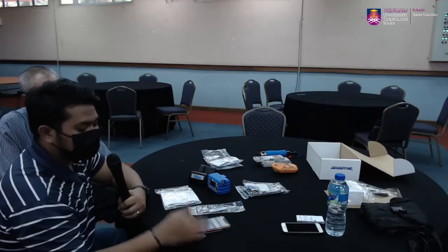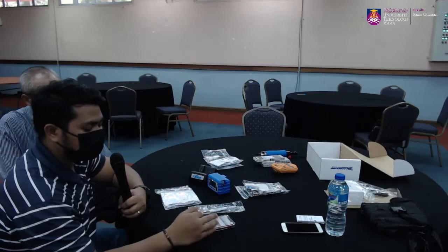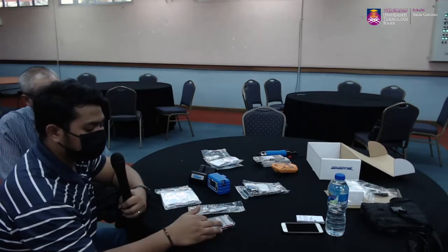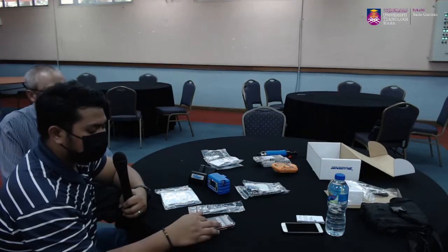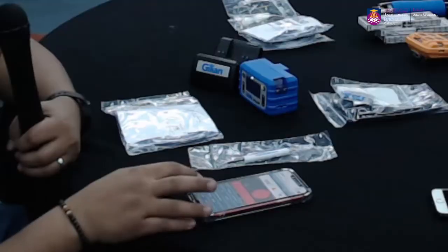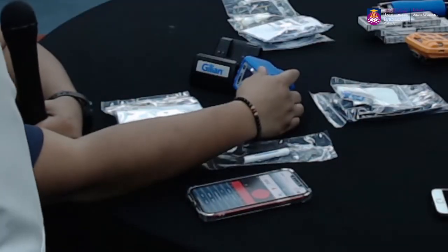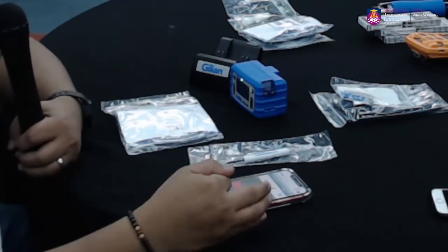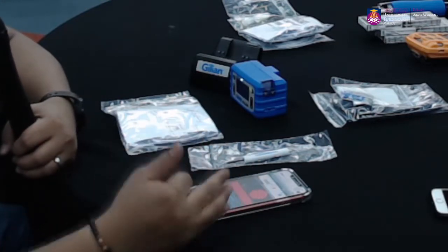So kalau contohnya dia akan bagi kita in terms of graph and juga pie chart. So daripada sini kita boleh analyse further in terms of kita punya apa yang dah go through with the pump. And then elapsed time, run time. So far dah berapa lama. And then projected run time. Okay, yang macam kita tengokkan kat sini juga, in terms of 8 hours. So sama juga 8 hours. So daripada situ they will show you everything what the pump is showing. And then in terms of daripada kita boleh tengok.